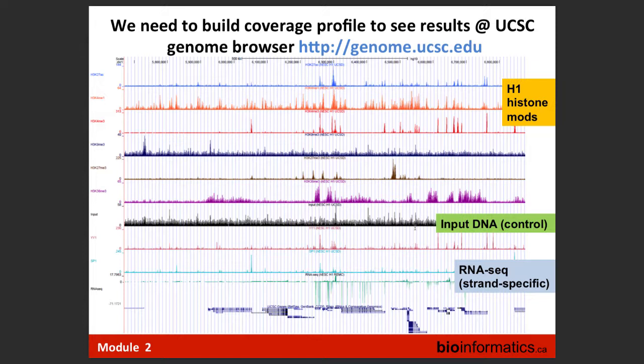If I zoom in, and probably in the further slides I'll have something to zoom in, that's the profile we see here. So usually when we run conversion of a BAM file into the wig format file, this is called wig format, we just get those integer numbers. Now, the total number of reads is different. If I have library 1 and library 2, I can have different total numbers of reads. Of course, then if I really look at the number on the left, in one case it's 160, and in another it will be 20.